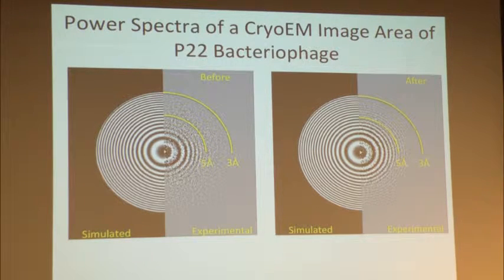If we don't do the proper data processing, we just lose it. So I think these detectors allow us not to lose it. The data go all the way to 3 angstrom resolution. So that is the kind of quality that we are getting from these kinds of detectors.